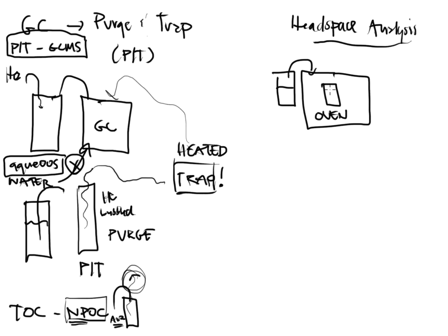The purge and trap system doesn't quite do that. It does not really have an oven. The only thing it's doing is purging volatile organics out of the sample and trapping them, and it's only really doing that through the process of a little bit of helium. Well, the Headspace analyzer will actually put the sample into an oven and heat it up as hot as I need it to be heated up.